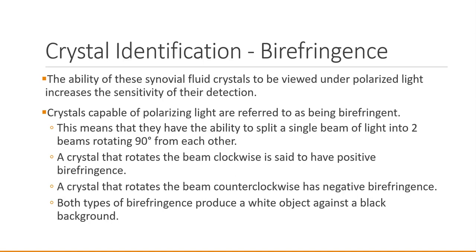Crystals that are capable of polarizing light are referred to as being birefringent. This means that they have the ability to split a single beam of light into two beams, rotating 90 degrees from each other. A crystal that rotates the beam clockwise is said to have positive birefringence. A crystal that rotates the beam counterclockwise has negative birefringence.